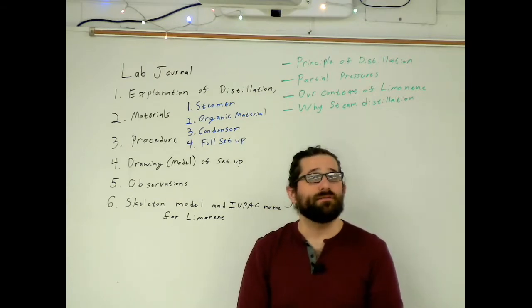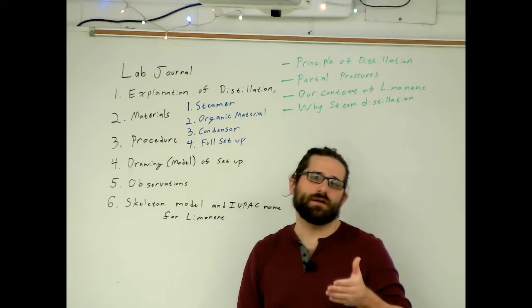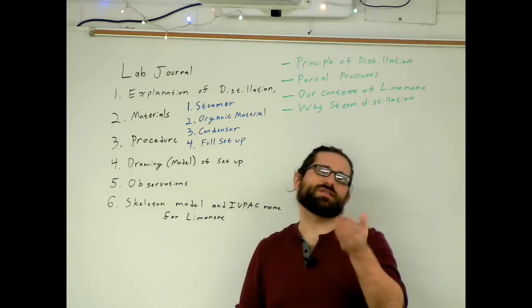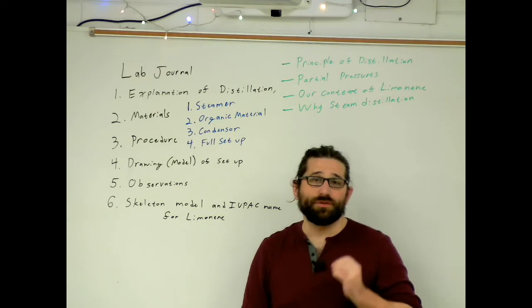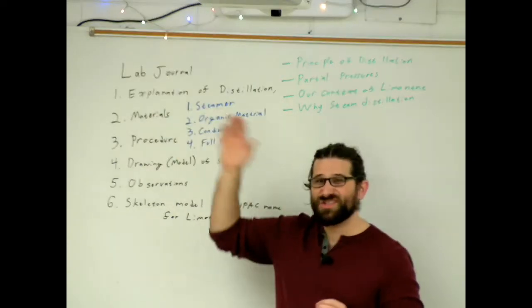I also have links to a website that will go into more specific detail on what the process of distillation looks like and how it specifically works, as in chemically what's happening here. For this lab, you'll need to do a write-up. You'll be writing up in your lab journal 6 points.